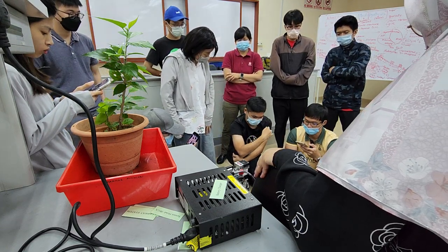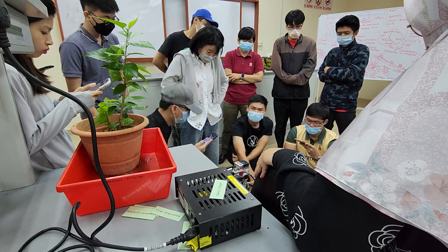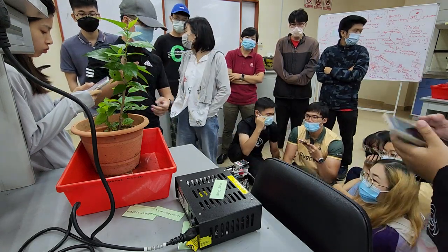Why did it put a screw again? So now you can choose your plug. Everything is ready here. So now you can start to take the environment, take the measurements. So which plant do you have? Hibiscus.